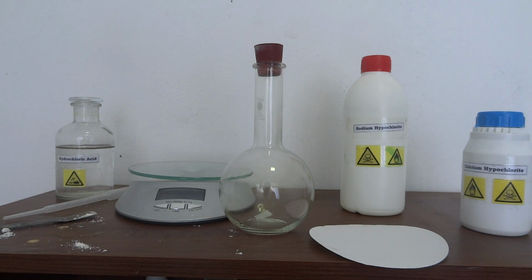If we drop a similar colored thing, for example a colored flower petal, a rose petal, it will also become white because it gets bleached. So today's point of the video is that chlorine is very dangerous, and chlorine is very useful in chemistry. So since chlorine is used several times, I really advise to work safe with chlorine gas. I learned that the hard way.